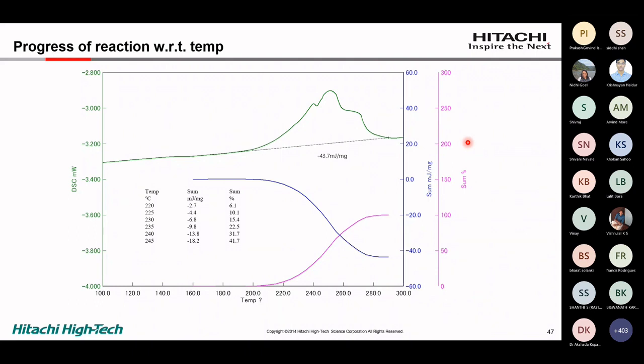This is the safety hazard analysis. So many times you hear that in so and so factory an explosion has taken place. That explosion is taking place due to the in situ reaction, which is occurring in your reactor or inside the vessel.